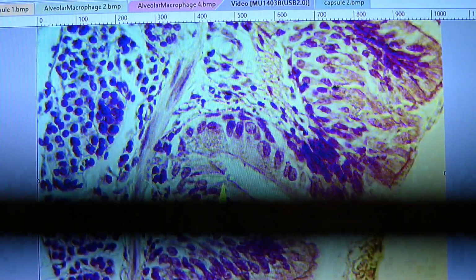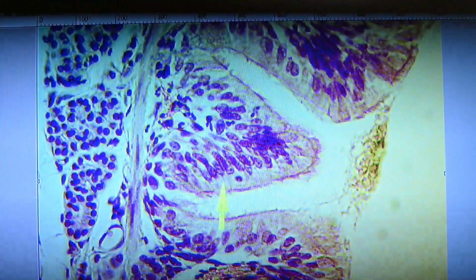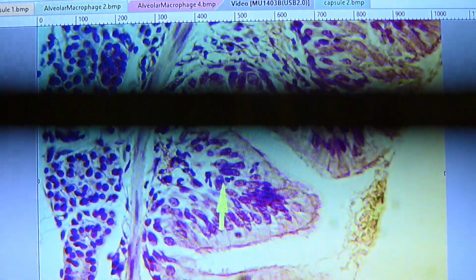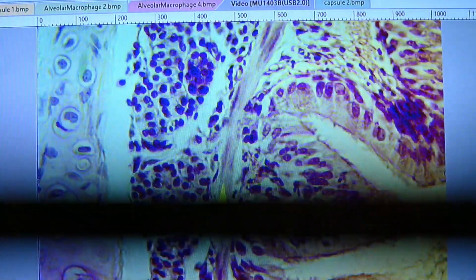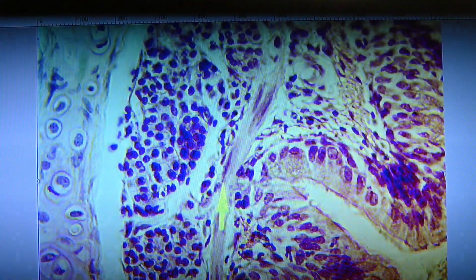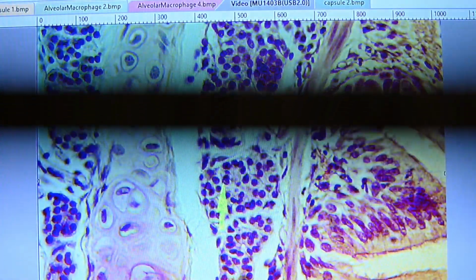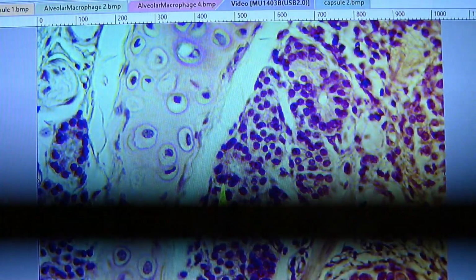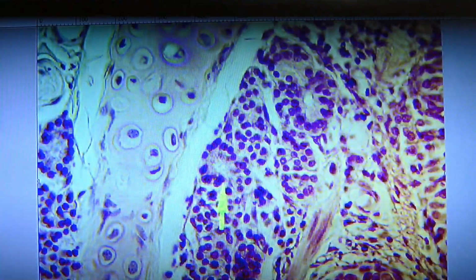It's not a very smooth or even ciliated arrangement there, but anyway, we still have that pseudostratified columnar epithelium on the wall. We have a bit of lamina propria underneath that epithelium down in this region, and that continues on out to the cartilage and so on, but there's some smooth muscle mixed in. Smooth muscle here, and this is mostly glandular tissue, serous glands. You see a nice circle of cells right here above the pointer. So those serous arrangements, those glandular structures all through there.